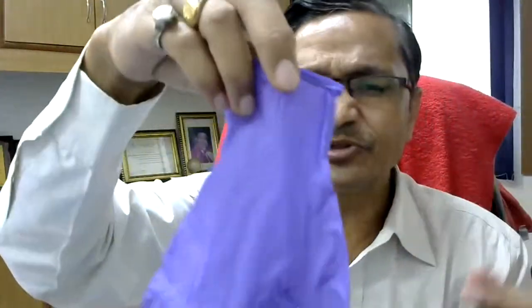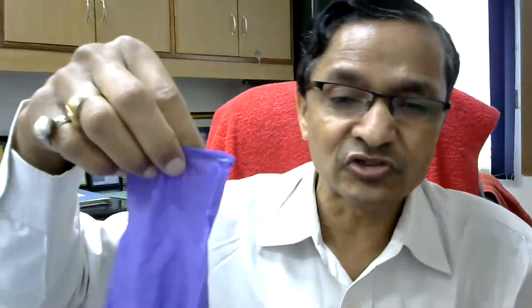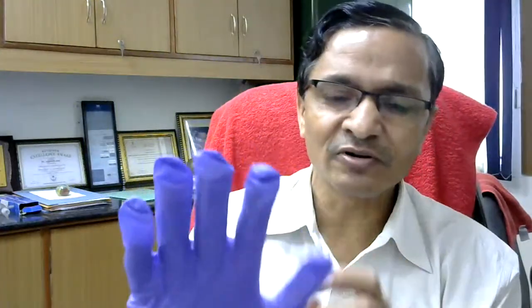So let me see. This is powder free gloves, means there is no powder inside, but while wearing the gloves you have to make sure that your hands are not wet. It should not be wet, it should be dry. So my hand is dry, I will try to wear the gloves. See, all four fingers have gone in place, and then I wear it like this. You can see it is fitting well.